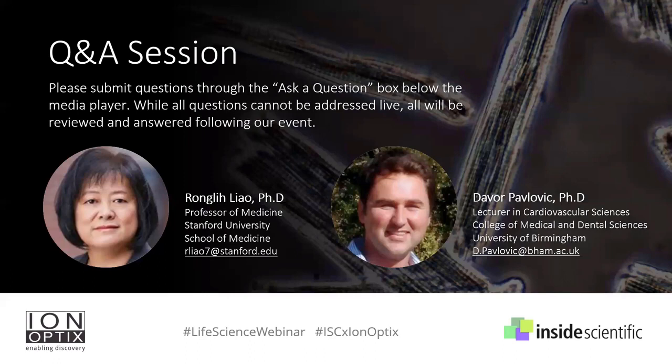Sure. Well, it also does depend on what your aims are. Most of us will do short-term culture, maybe 1 to 2 days. And in our experience, most culture media will give you very similar results. You'll be able to successfully culture cells for, let's say, 1 to 3 days. And then after that, you'll see that the cell edges are coming in. You'll see loss of T-tubules. And mostly then the cells will be unusable.